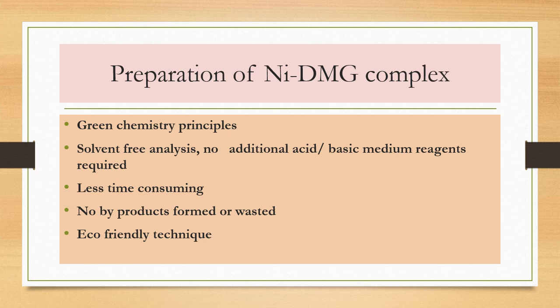Second preparation, that is from the syllabus, the nickel DMG complex, nickel dimethyl glyoximate complex. Again, this second preparation is also based on the same principle, that is the green chemistry principle, but the salient feature of this complex is that it is a solvent free synthesis. There is no addition of water, no addition of acid, or no addition of any basic medium reagents. It is less time consuming.